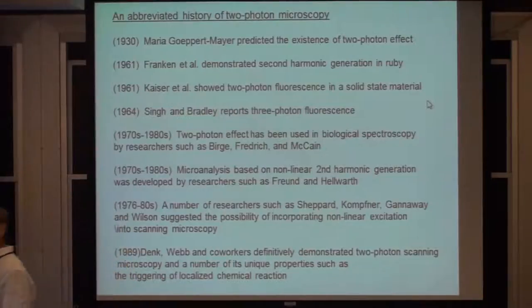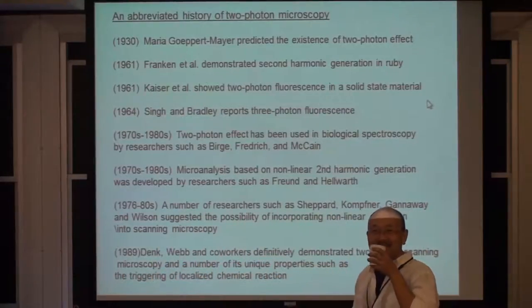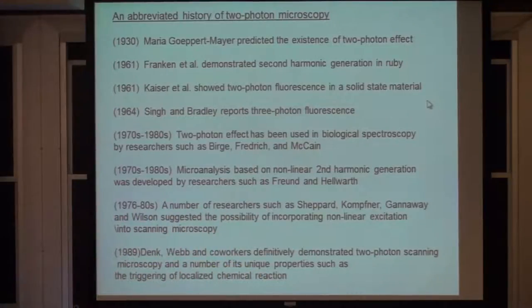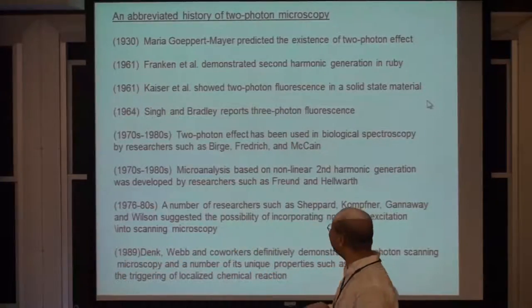That's also important. If you look at the chronology, there's the 1930s, and the next step is the 1960s, the first experimental demonstration of the two photon process. What happened in the 1960s? I know some of you know. What do you think? One of the things you need for efficient two photon excitation is a lot of light, specifically a lot of coherent light. That means you need the invention of the laser. The laser is, of course, another major invention, and I think this one made quite a bit of money for some people, although there is a huge legal case associated with it.